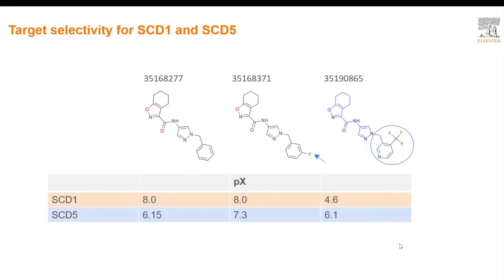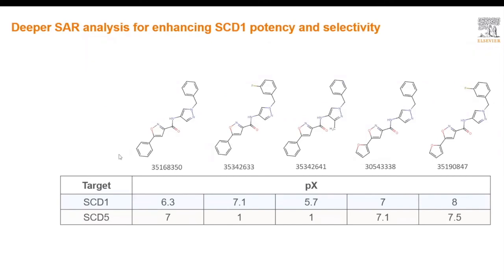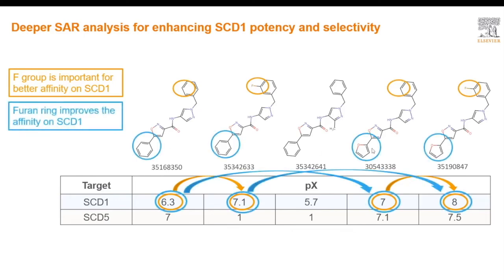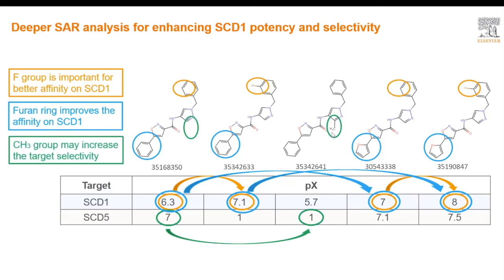Looking at a different scaffold, we see that addition of fluorine to the benzene ring at the end of the molecule results in increased activity against SCD1. Addition of a fluorine group to the other end of the molecule also results in increased activity against SCD1, while retaining some level of selectivity against SCD5. Addition of a methyl group off the pyrazole ring results in a dramatic increase in selectivity against SCD5 and a small decrease of potency against SCD1.